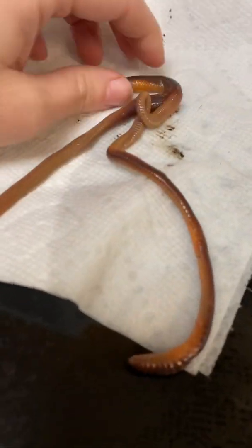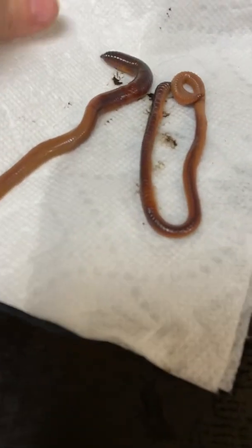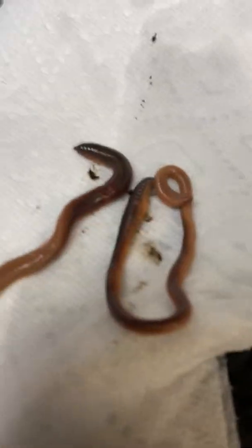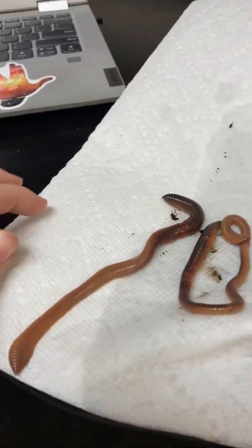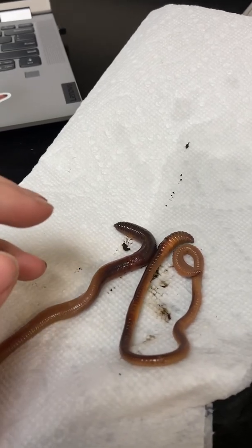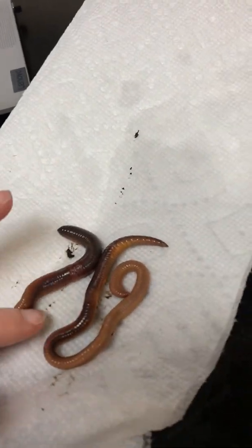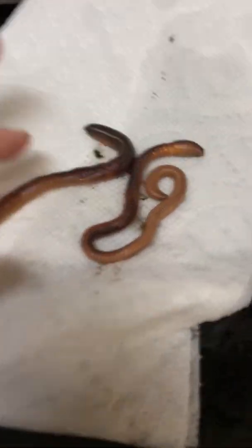You look at them, other than size, there's really no major differences in physical appearance other than the general size. Then 28, can you tell if your earthworm is a male or female? Why or why not? Trick question. If you did the notes, you should know this.